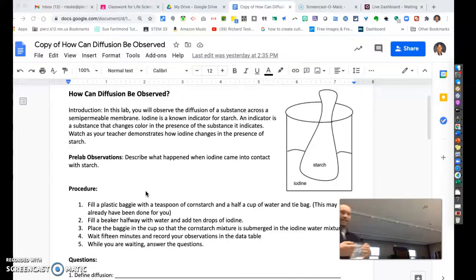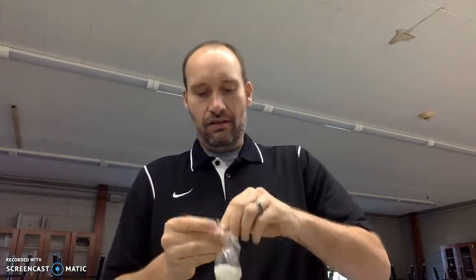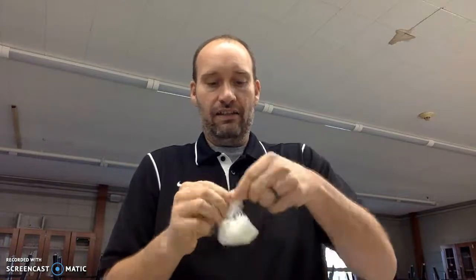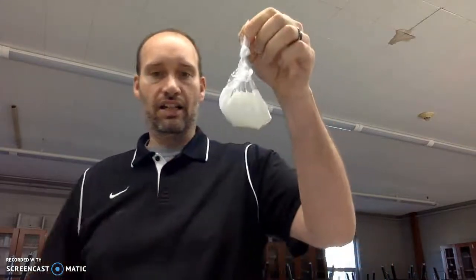All right. Now, sorry, but I put the water in, and here's the water. And why don't I just make myself full screen? All right. Now, here's my water. I'm just going to mix that up, and that's just cornstarch and water. So now I'm going to tie this. Of course, if you guys were in class, you'd be doing this lab. But, next best thing, huh? Watch Mr. Teskey do it, I guess. Good or bad, whichever way you look at that. All right. So I'm just going to tie it in a knot. And there's my cornstarch and water.